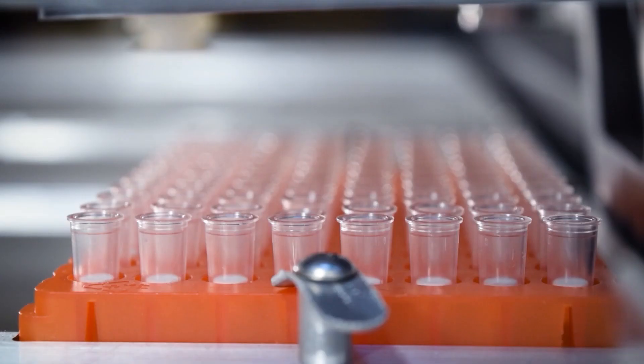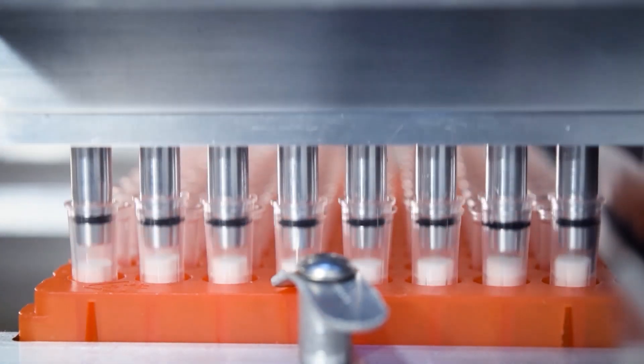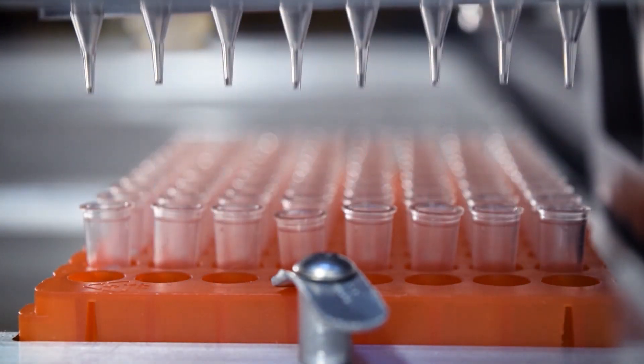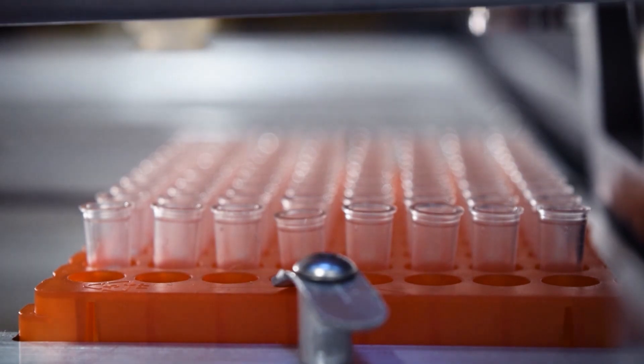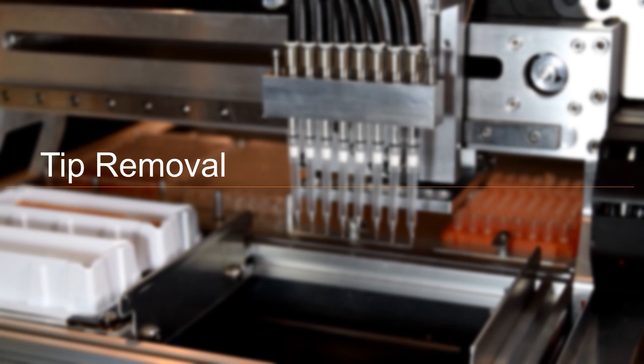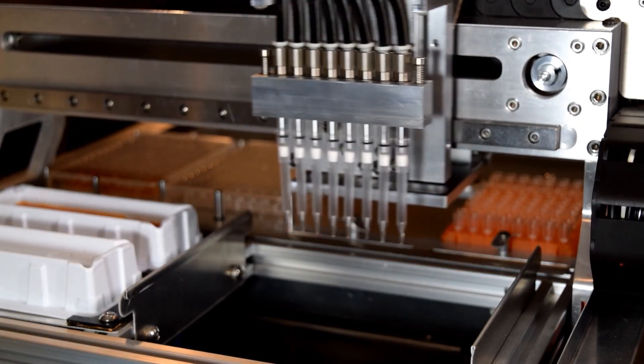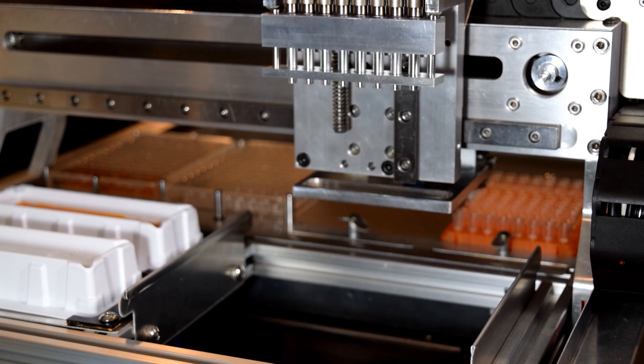The pipette tips are loaded onto the nozzles by driving the Z axis downwards into the nozzles which are held in a standard tray. The nozzles are spring loaded to allow for compliance with the tips and prevent crashes. Tip removal is accomplished via a spring loaded mechanism which actuates when the Z is moved all the way to the top limit of its travel.